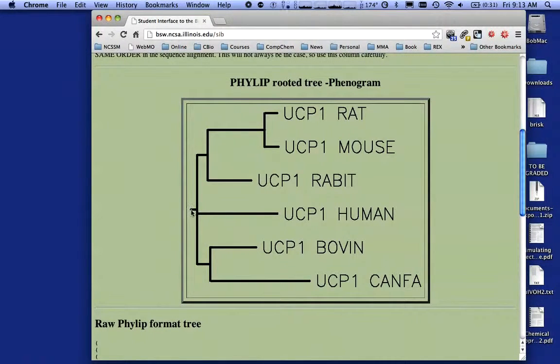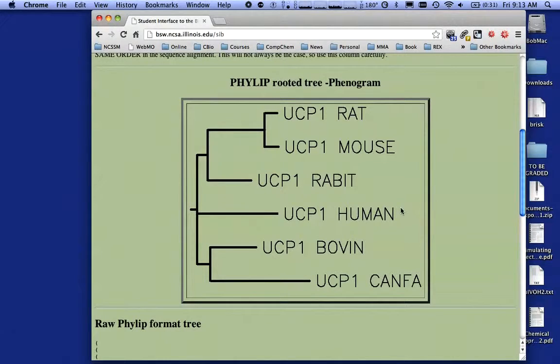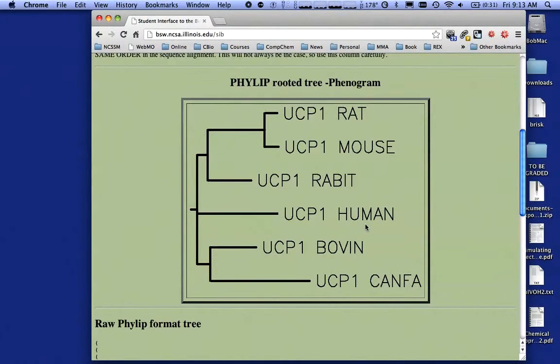With this particular model, if I were looking for a good animal model, there's not a particularly good choice for humans since humans evolved on their own branch. But I might pick mouse or rat — it looks like they evolved at about the same time as humans. I hope this helps, and good luck using Biology Workbench.